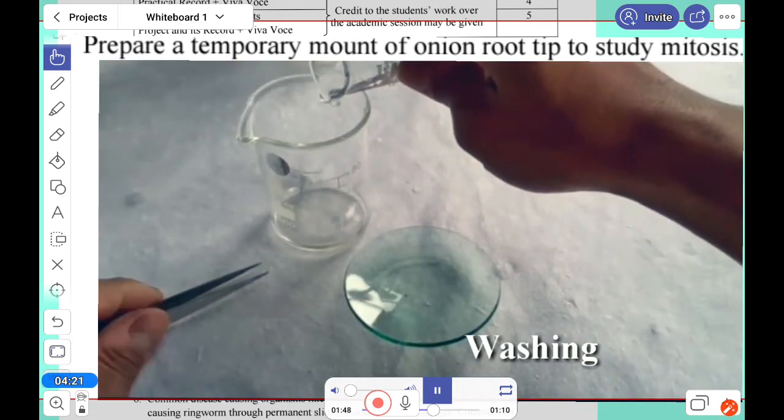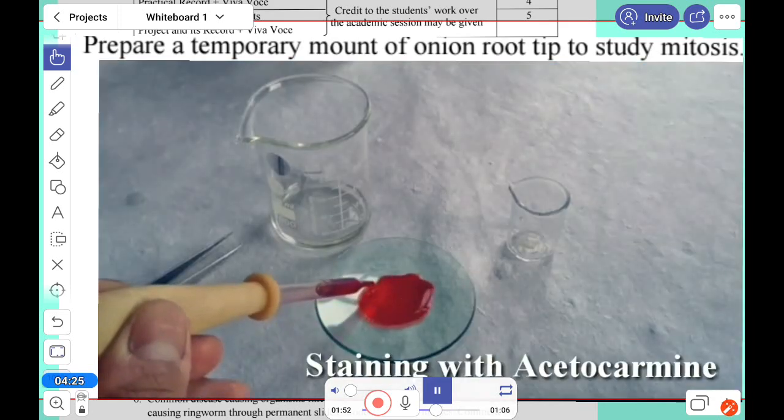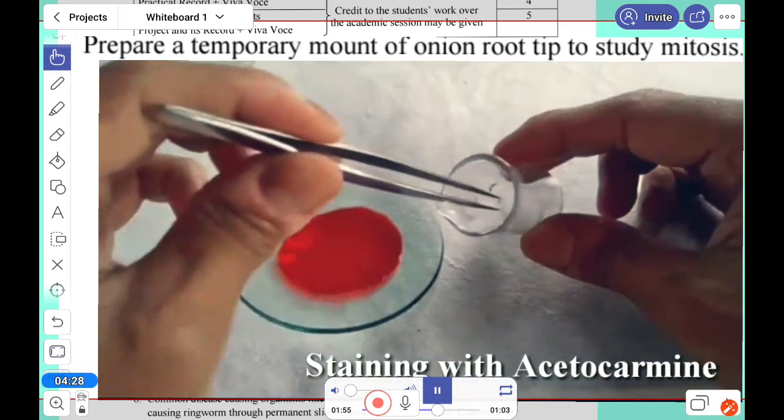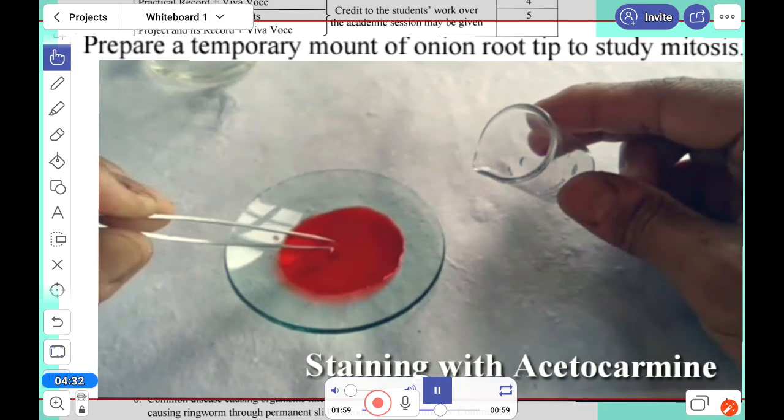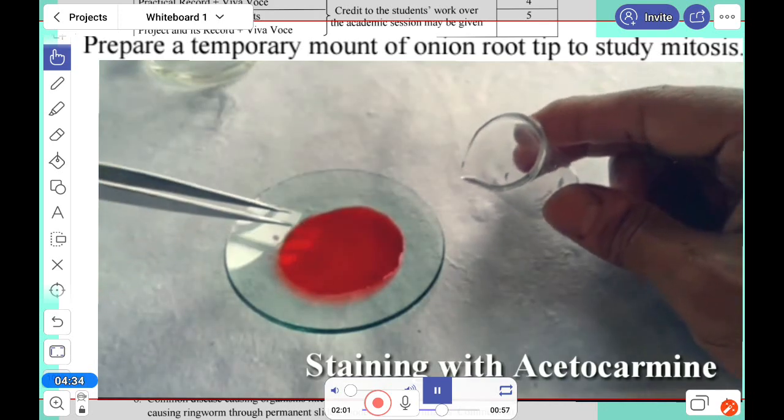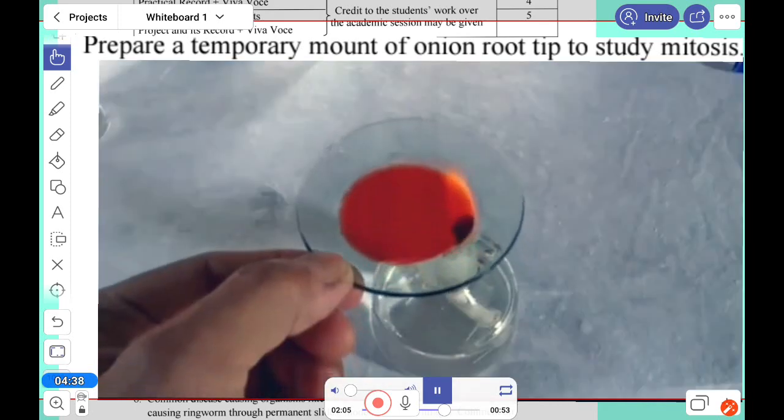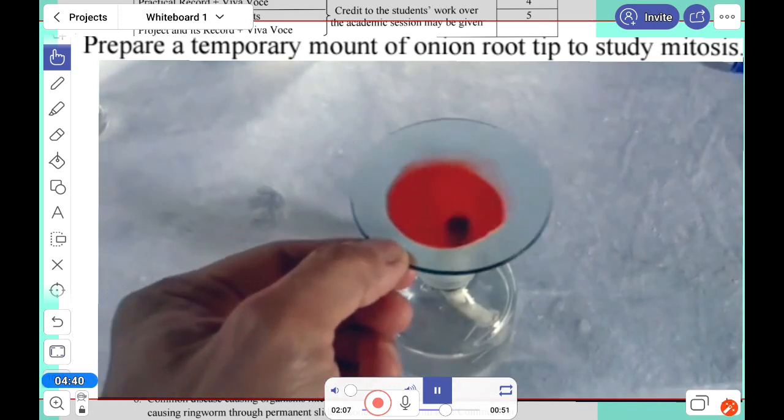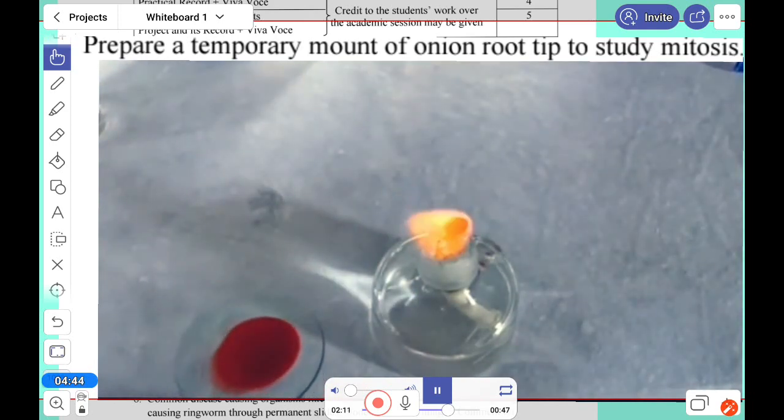Many times we have to wash before staining. Now staining with aceto-carmine. Aceto-carmine will stain the chromosomal part of the cell. We'll keep it and heat it a little bit to 70 degrees, make it cool again. In that way, we'll make it better stained.